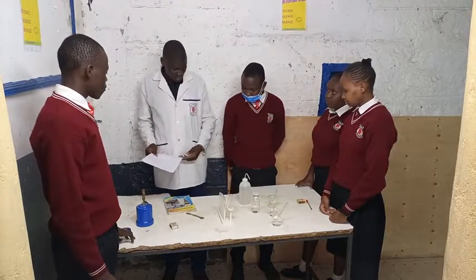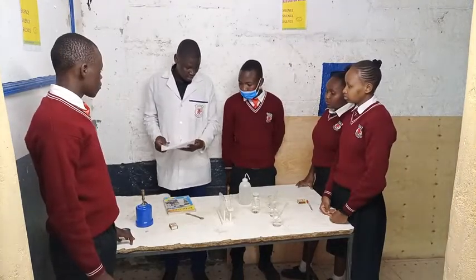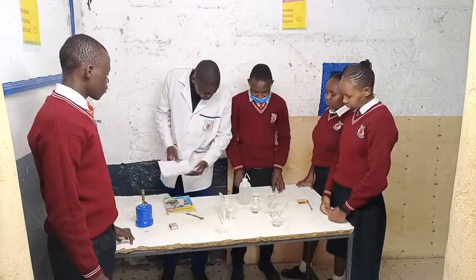About inorganic chemistry, test for cations and anions.